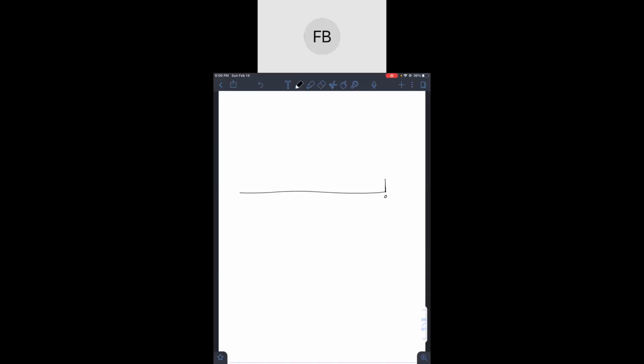So there's a few different things we're going to look for. There's singlets, which look like that. There's doublets, which are like that. Then there's triplets, which are like this, right? The quadruple one, which is like this. Whatever. So basically, it's all about the number of peaks. So this is a singlet. Inside, we're going to write S and then a bracket around that. This is a doublet, which is a D. This is a triplet, which is a T. This is a quadruplet, which is a small q.